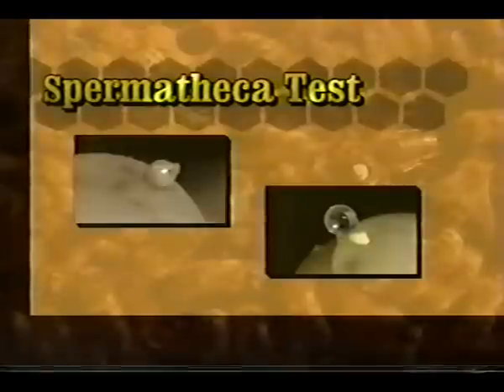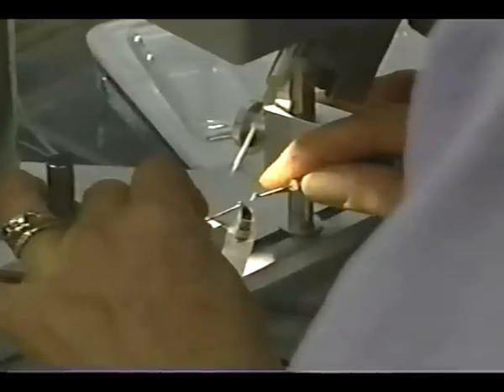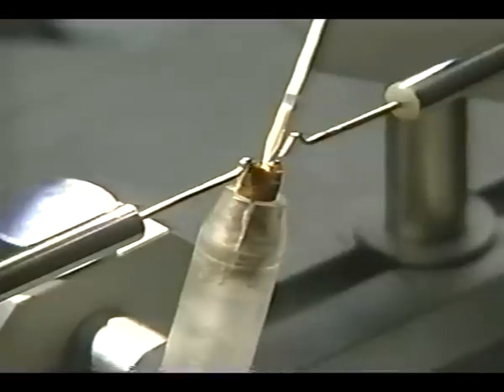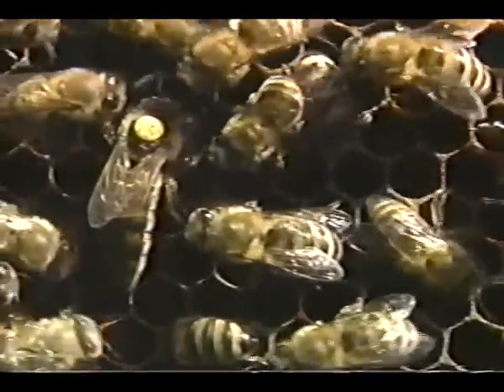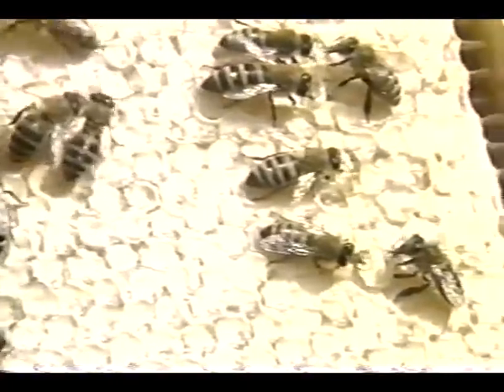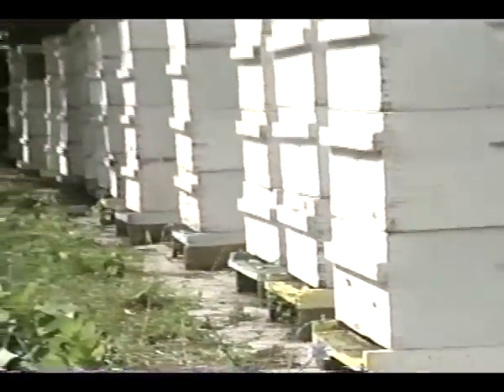To gain proficiency in the art of instrumental insemination requires practice and attention to detail. The first attempts may seem awkward and frustrating — concentrate your efforts on learning each step of the technique and establish a routine to maintain highly sanitary conditions. With experience, you will increase your success and efficiency. Instrumentally inseminated queens are capable of heading productive, income-producing colonies. This technique has proven valuable for the study of honeybee genetics and for the development and maintenance of selected breeding stock for commercial use, benefiting the beekeeping industry through viable breeding programs.